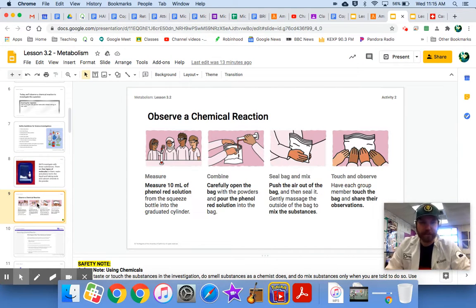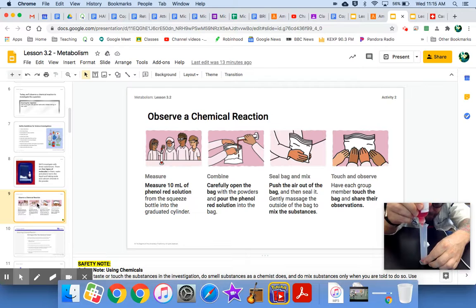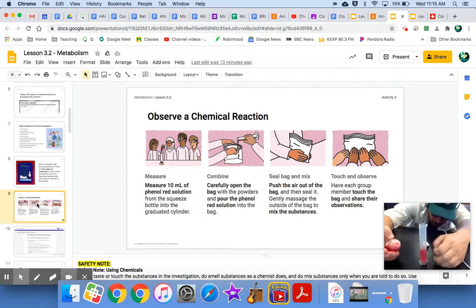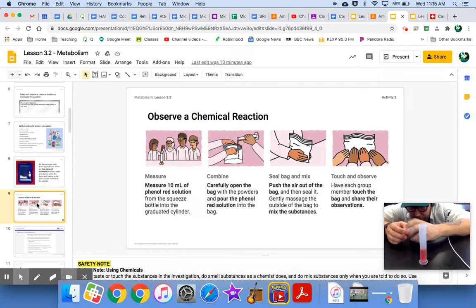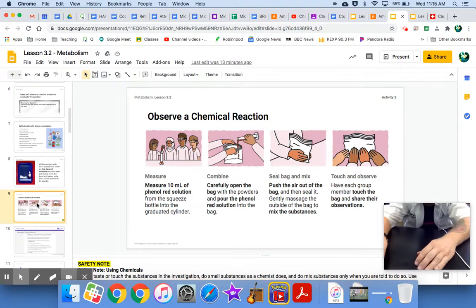So here's our procedures right here. Measure 10 milliliters of phenyl red solution from the squeeze bottle into the graduated cylinder. I'm going to do that with you right now. Let me don my safety glasses. Here's my graduated cylinder. Let's get 10 milliliters of phenyl red in there. I have exactly 10 milliliters of phenyl red in my graduated cylinder. I know it went up to the 10 milliliter line and I have my graduated cylinder on a flat surface and I'm measuring it at eye level. Great. Awesome.